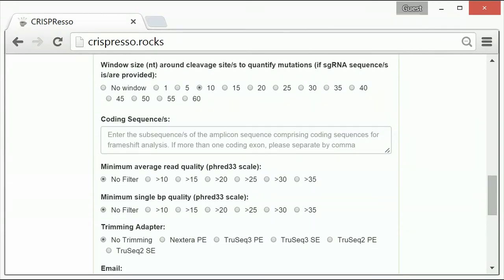The sixth optional parameter is to provide coding sequence. Entering coding sequence allows CRISPResso to quantify frameshift versus in-frame mutations present in the sequencing data. In order to perform this analysis, the coding sequence must be entered.